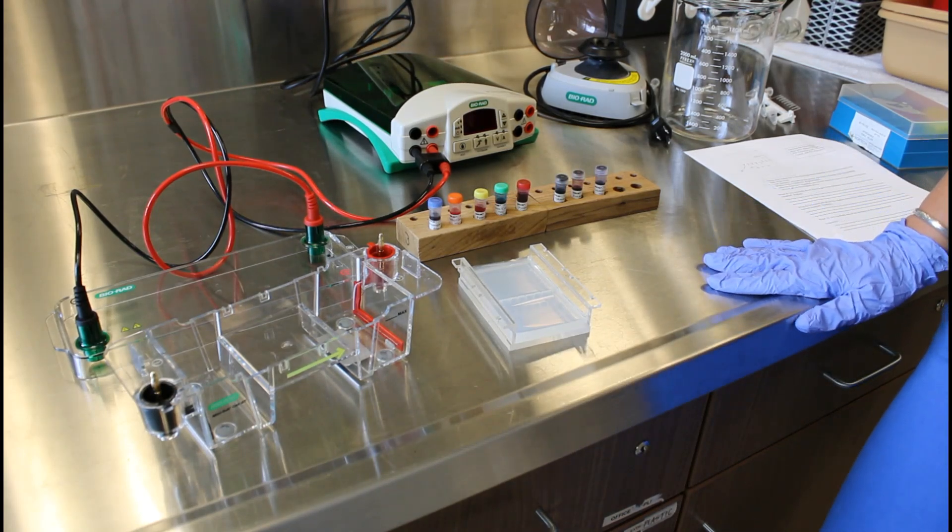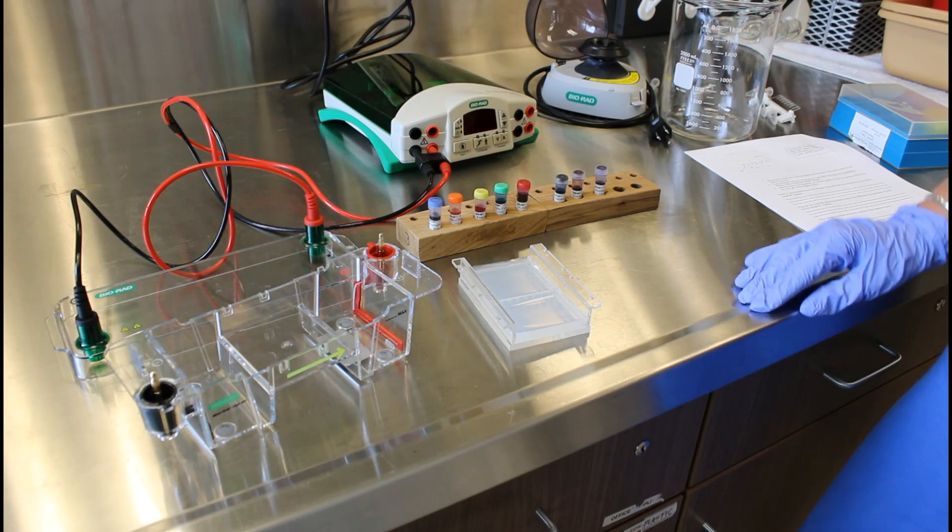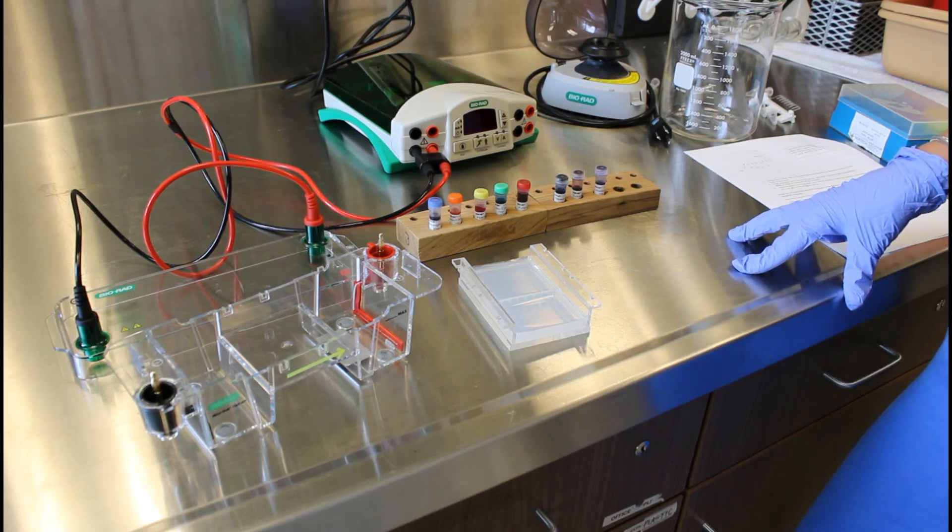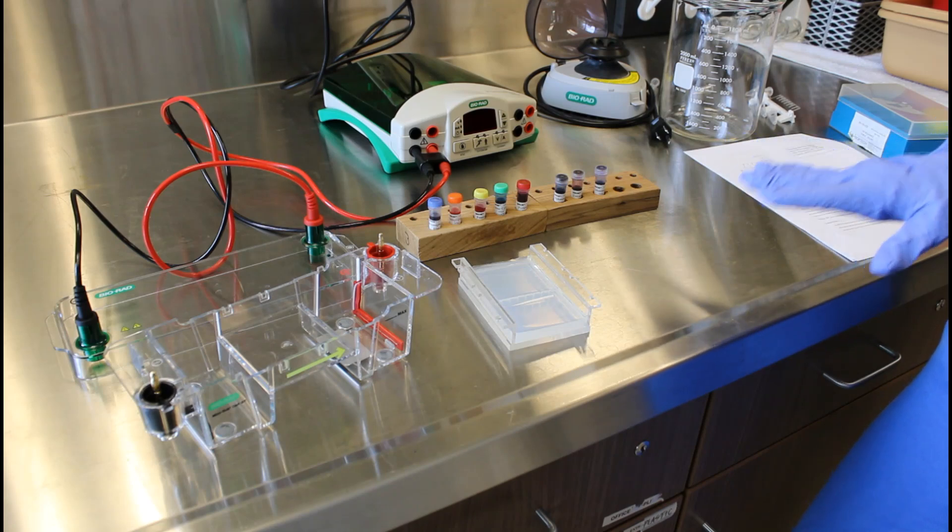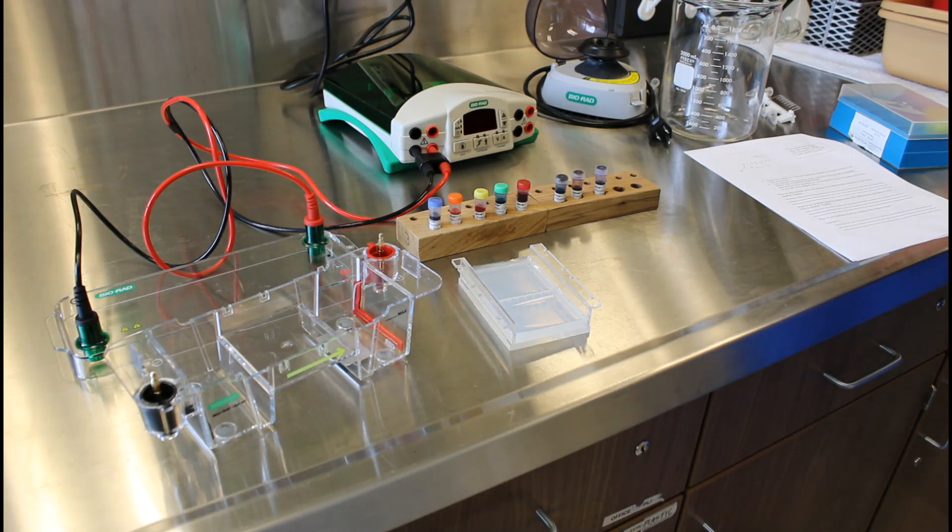Right now we're going to look at gel electrophoresis, which is a technique that's used a lot in biotechnology. It's a great technique for separating things out based on their size, used to separate fragments of DNA based on their size or to separate out proteins.